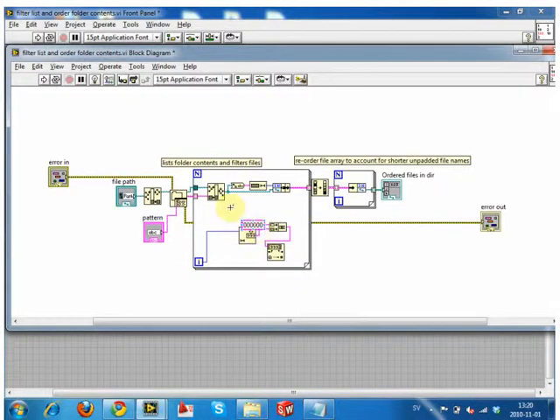We can say, look, if we need 3 zeros because we've got 3 characters, then it'll modify itself depending on how many files there are. If all of a sudden you're in a folder that says there's 1,000 files, it would say, okay, I'm seeing the number 1,000, that's a character length of 4, so I have to pad with 4 zeros. You can actually make it modify itself, so you don't have to have a hard fixed number. We have a hard fixed number here because this is an example where you wouldn't know. If you did know, then we could modify it.